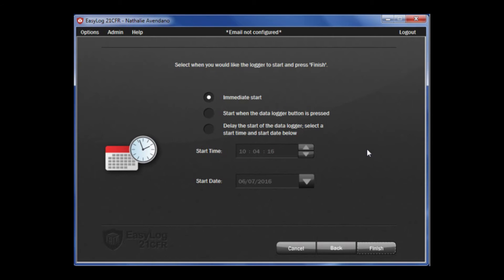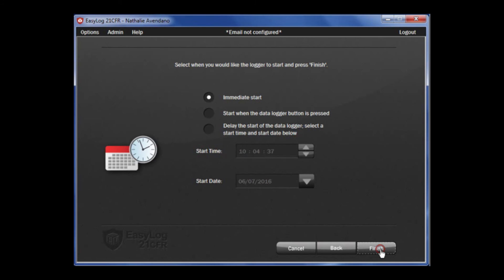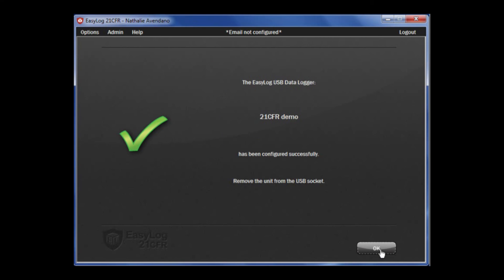Finally, you can set up how you want the data logger to start. You can start with an immediate start, a start when the data logger button is pressed, or select delay the start, which allows you to put a set time and date that you want the data logger to begin recording. Once that is complete, click Finish, and your data logger is now complete. Simply click OK to exit.